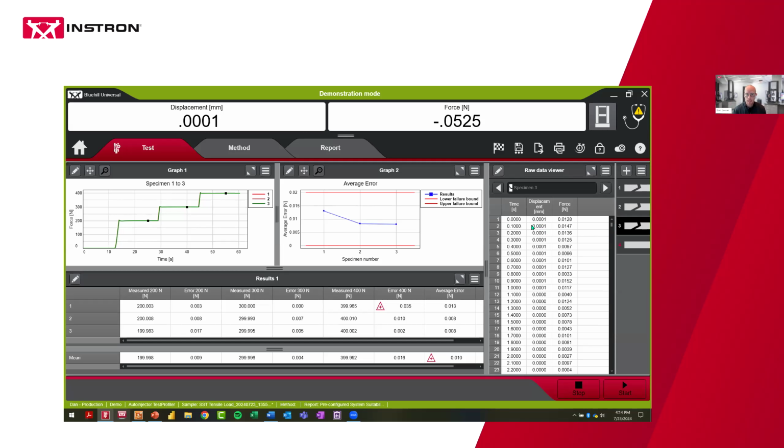The first reason is maybe 600 isn't the best representation, but you might have a sample that has thousands or tens of thousands of data points. And if you're running a lot of tests, that can produce files that are pretty large. So if you're trying to save on file size, maybe you want to take something that has 25,000 points and bring it down to 1,000, because that's all you need when you're referring to that file in its CSV format.